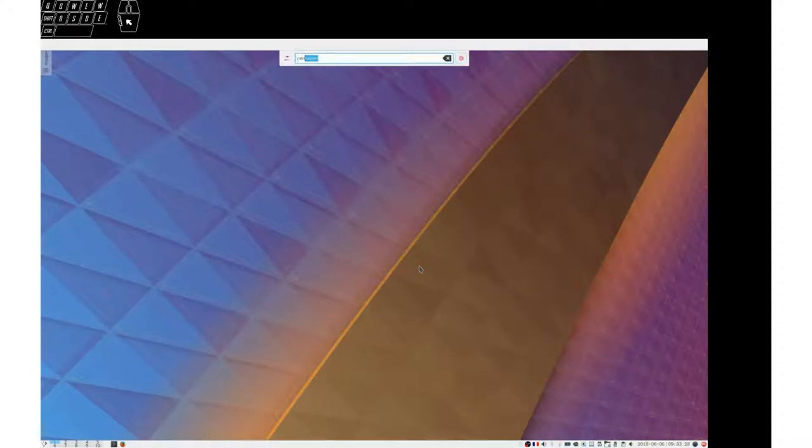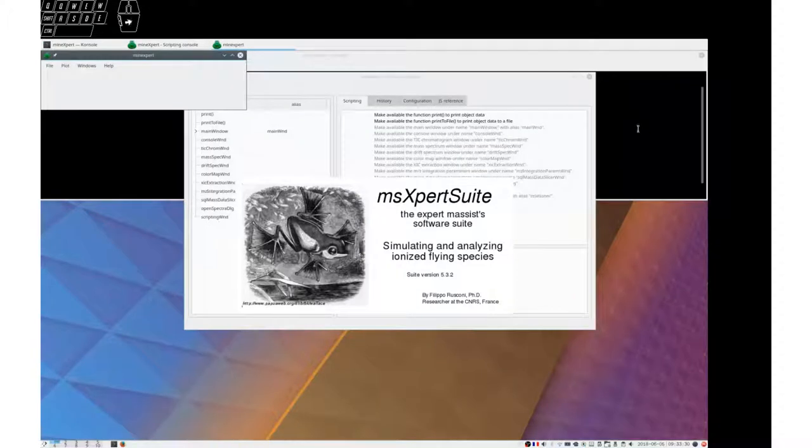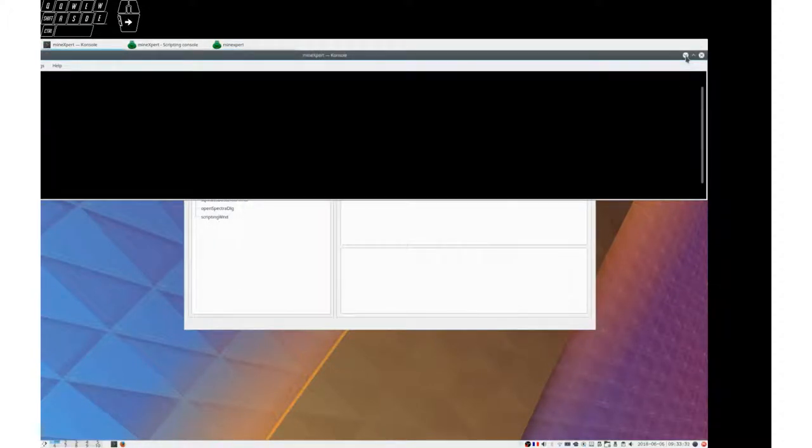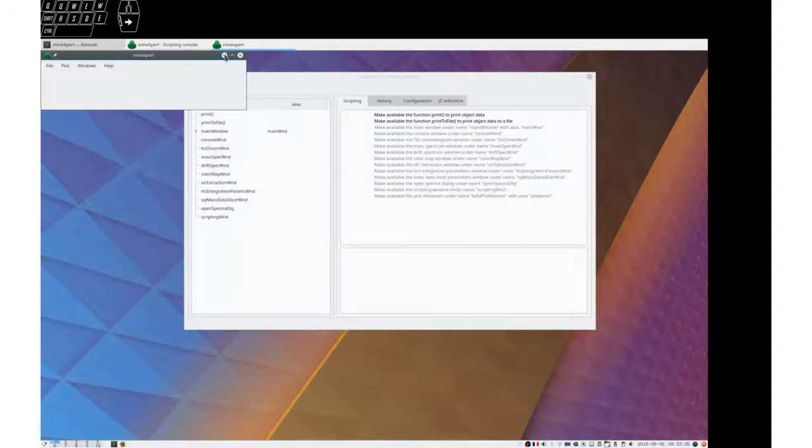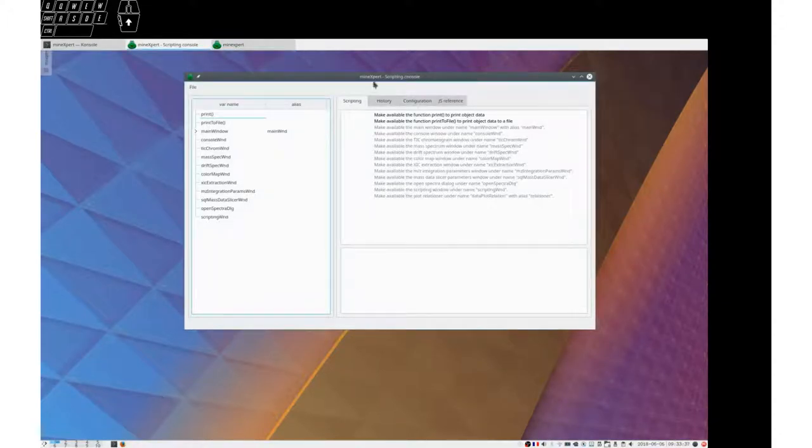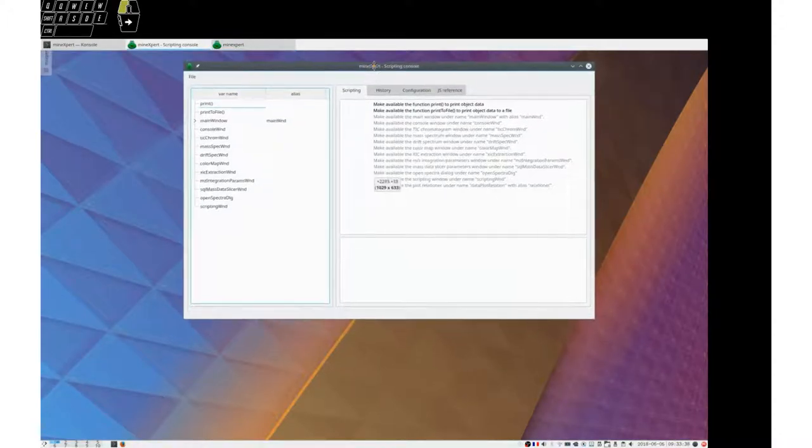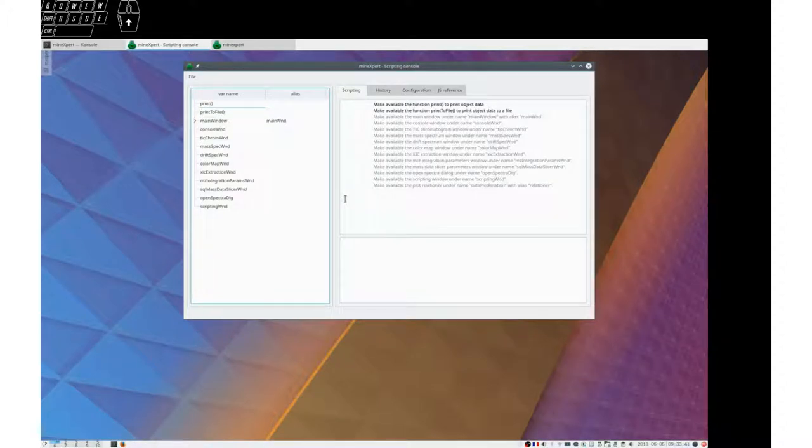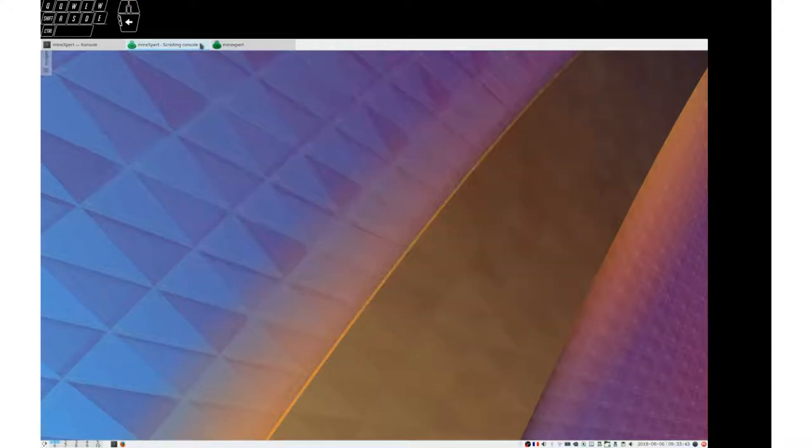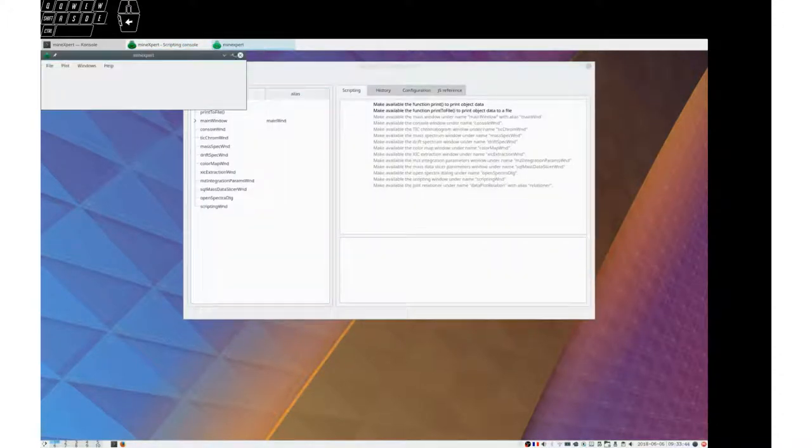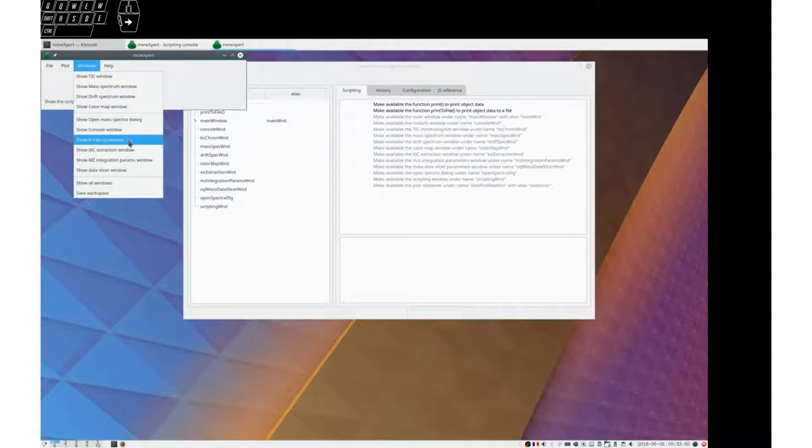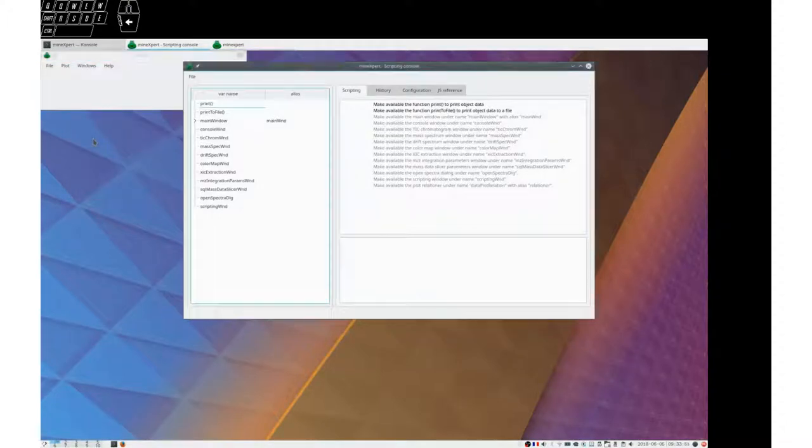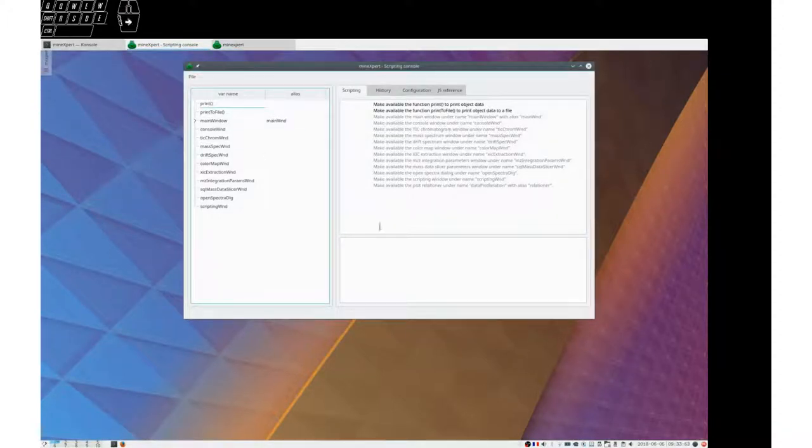Start MineExpert. This window we know we can minimize. We can also minimize this one. And we now have the MineExpert scripting console. And if the scripting console doesn't show up, the way to show it is show scripting window here. We can minimize this.